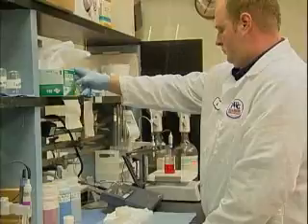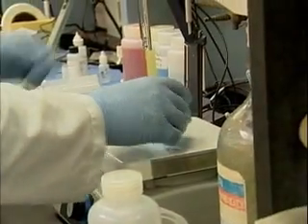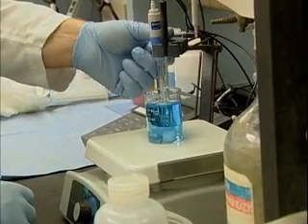Sometimes we get customers who call with a complaint. Depending on the nature of that complaint, we have a sampler who may go out and we can check the chlorine, the pH, and also the turbidity of the water. For most of the tests, the sampler goes out to the home and collects the sample, and the sample is brought back to the lab. Most of the parameters that we run on the sample are done in-house.